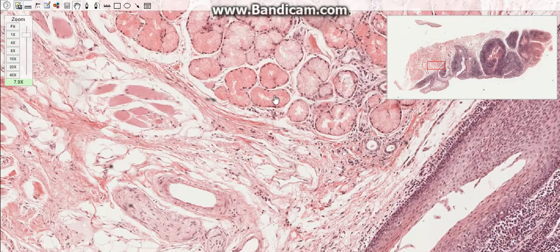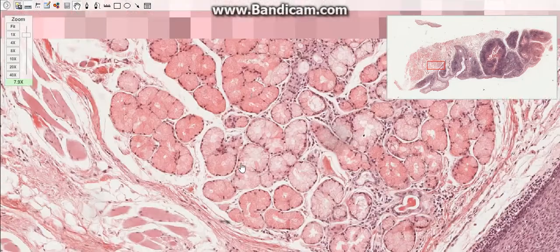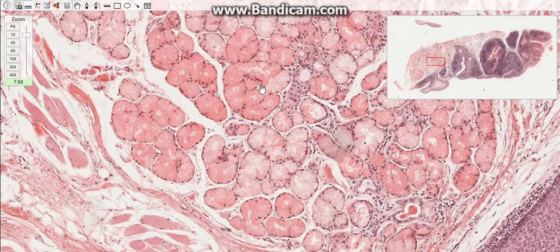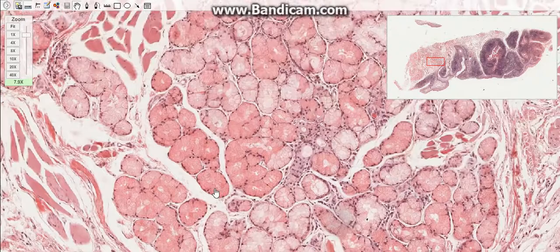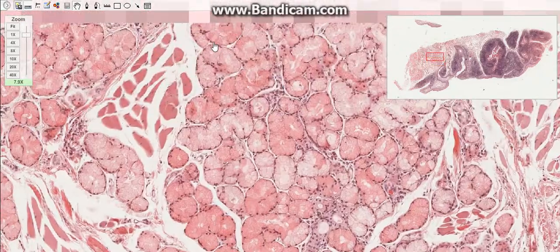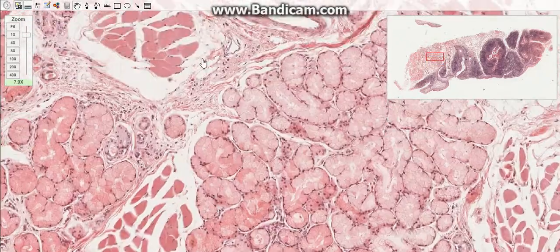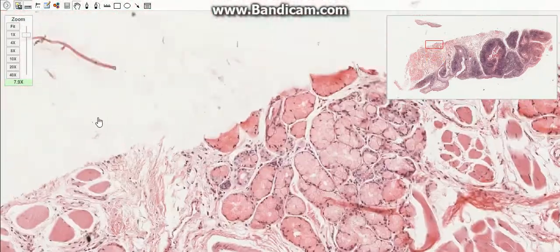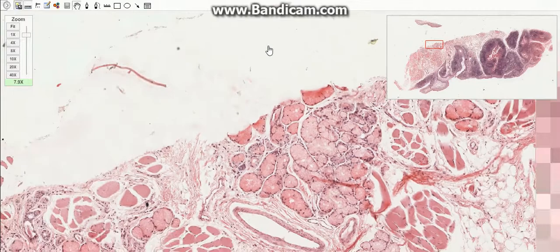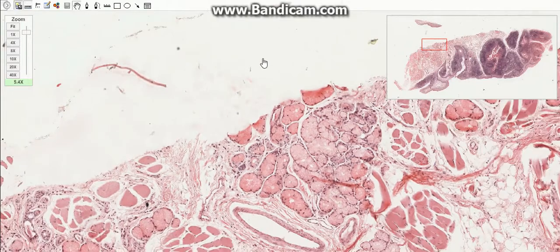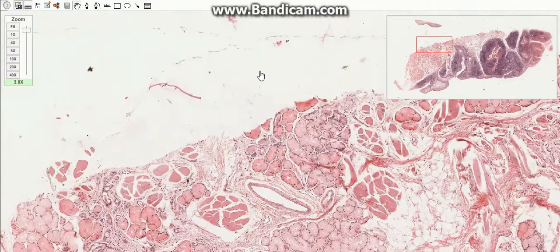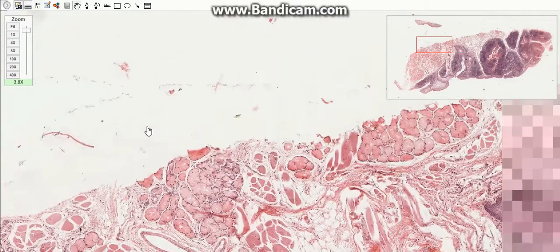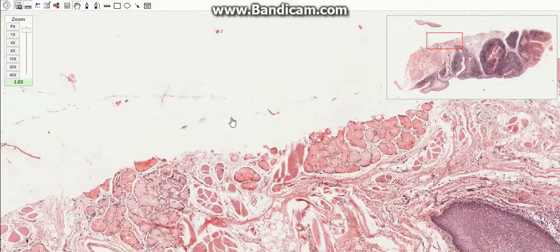The blood vessels and salivary glands are located in the submucosal layer at the base of the tonsils. This base is separated from the underlying muscle by connective tissue, forming what is called the hemicapsule. This capsule acts as a barrier against the spreading of tonsillar infections.